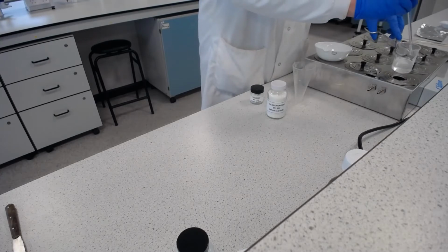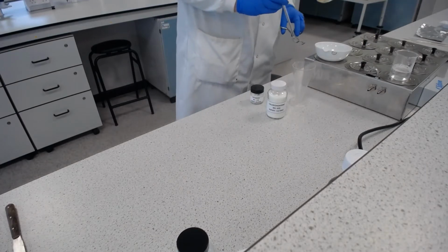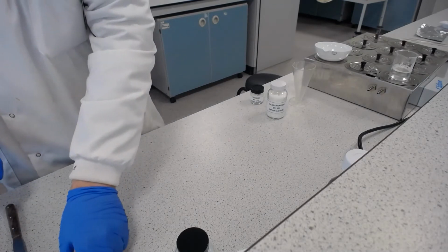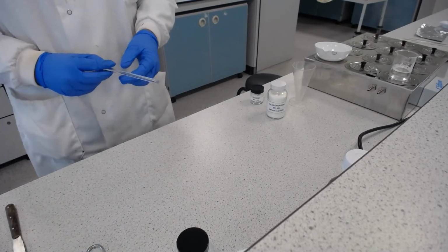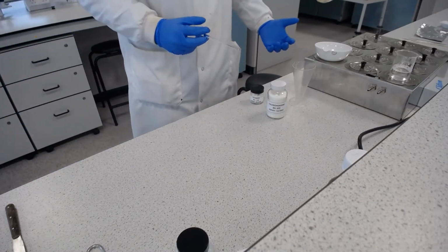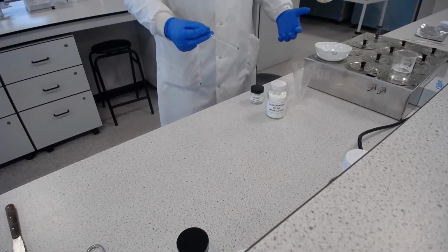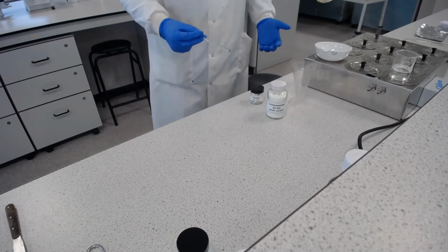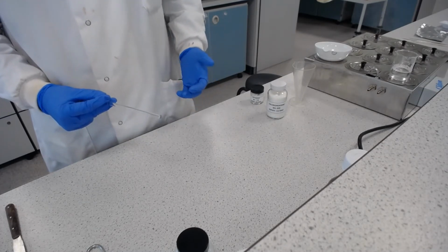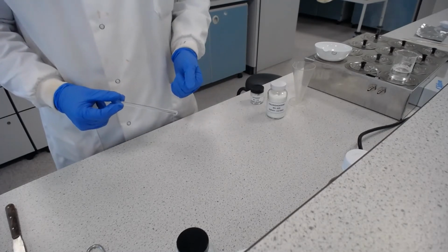So I'm happy that both of these phases are now ready to go. And then we need to start mixing them together. So we need to ensure that the temperature of both the oily and the aqueous phase is around 60 degrees centigrade. So you might want to check that with a thermometer at this stage. I'm happy with the temperature of this water bath and how long they've been on there, that they're going to be at about the right temperatures for me to mix them, although I wouldn't want to leave them on there for much longer. So I need to gradually add the two phases together by transferring the oily phase into the aqueous phase in small parts and gently stir until it is cooled.